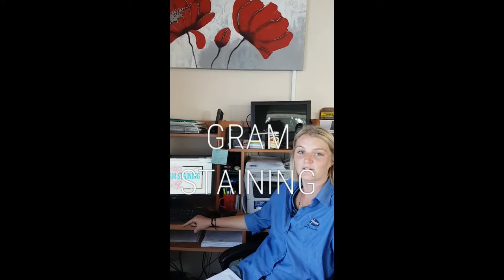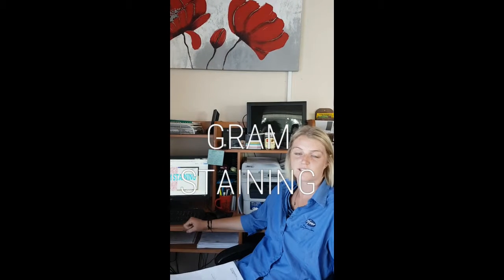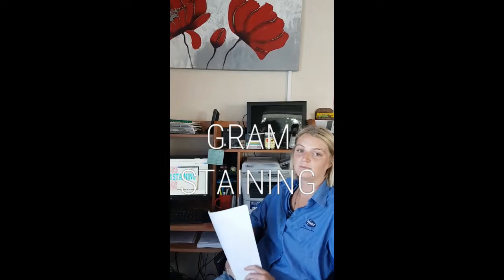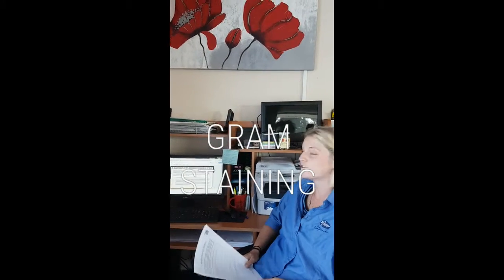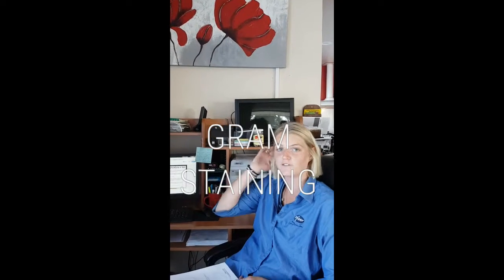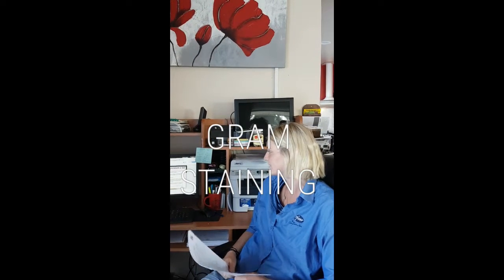So today we're talking about gram staining. This is the new procedure I'd like to bring into the clinic. First of all, description of the diagnostics procedure or test.